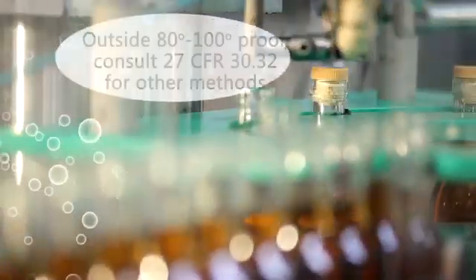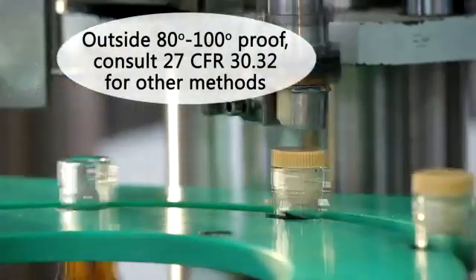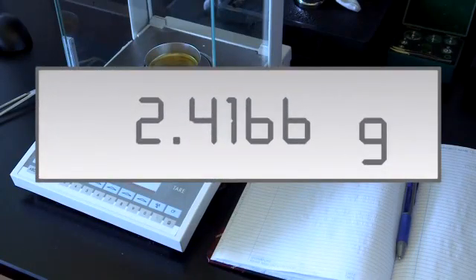The evaporation method may be used only for spirits in the range of 80 to 100 degrees proof. An analytical balance reading to at least four decimal places is needed for this test.